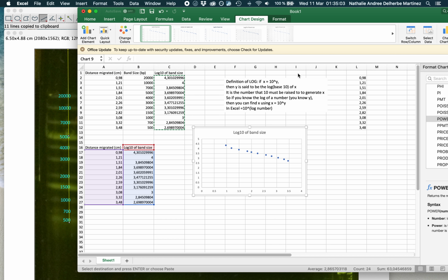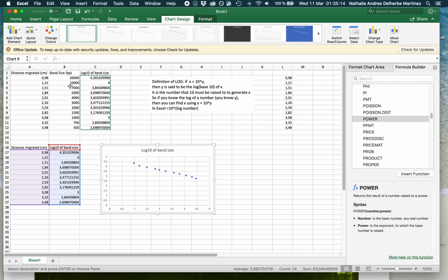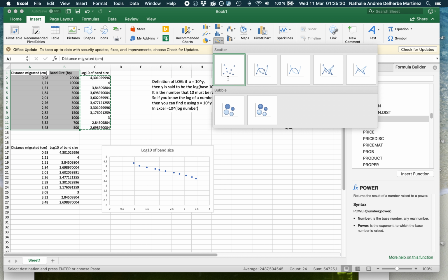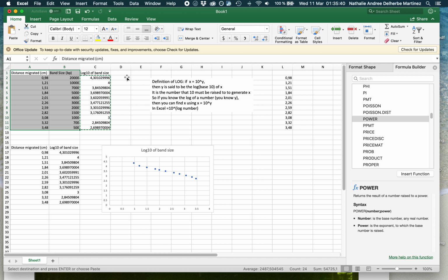So now we have a line from which we can obtain a linear equation. I will just show you why it's more difficult to do it directly from the raw data. You don't have to do this, but it's a logarithmic curve, right? So then it's way more difficult to calculate back the equivalent data. So that's why we are using logarithm in base 10.